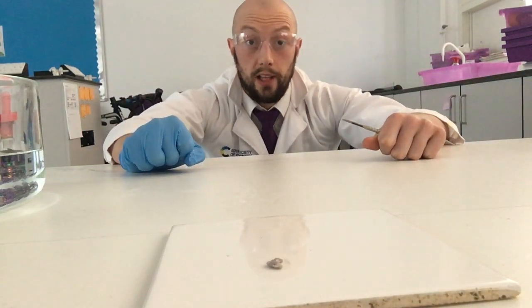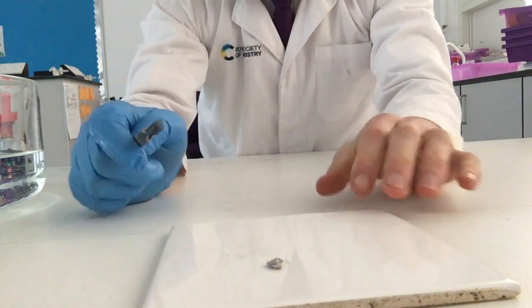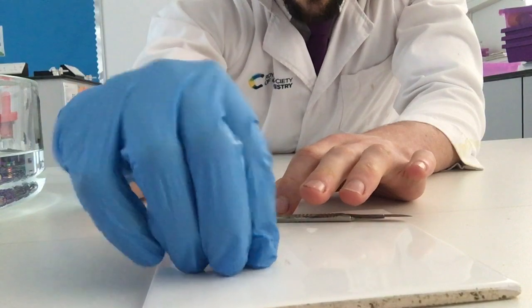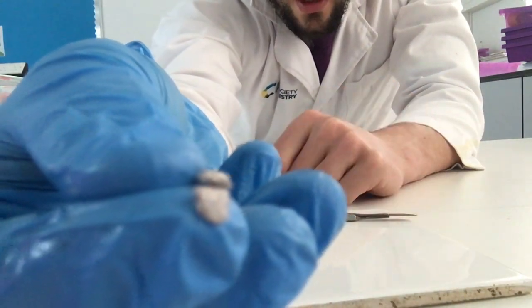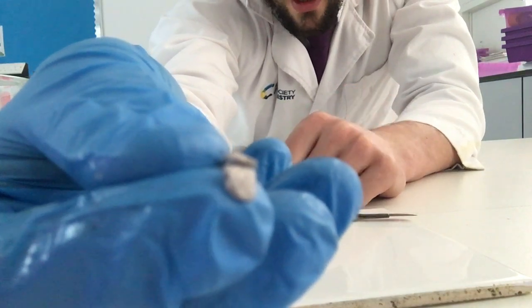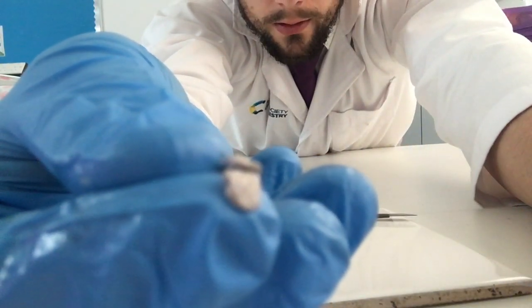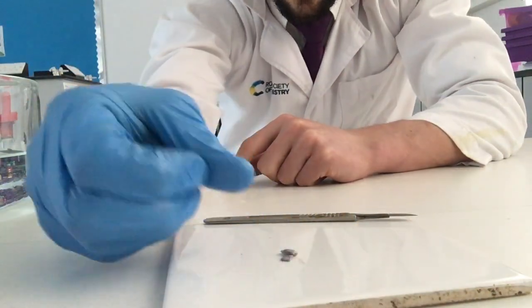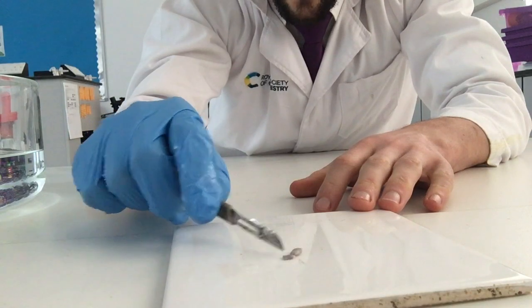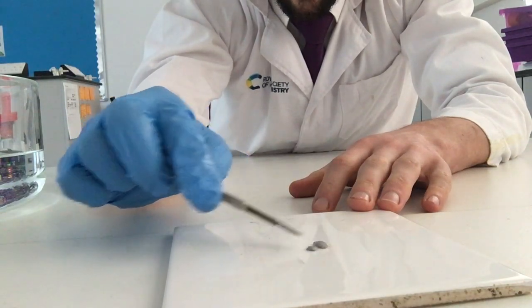We're going to look at some chemical properties of the alkali metals. So first I've got some sodium here. I want to show you this is a metal, but it's quite a dull grey colour. Now the reason it's a dull grey colour, I'll see if I can focus better on that. It's dull grey because it's reacted with oxygen in the air. So it's actually covered in a layer of sodium oxide. It's very reactive, so it does that reaction very quickly.